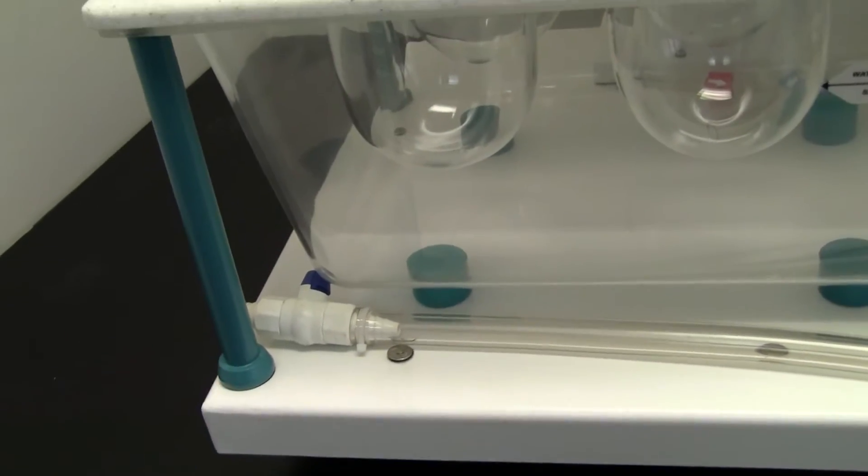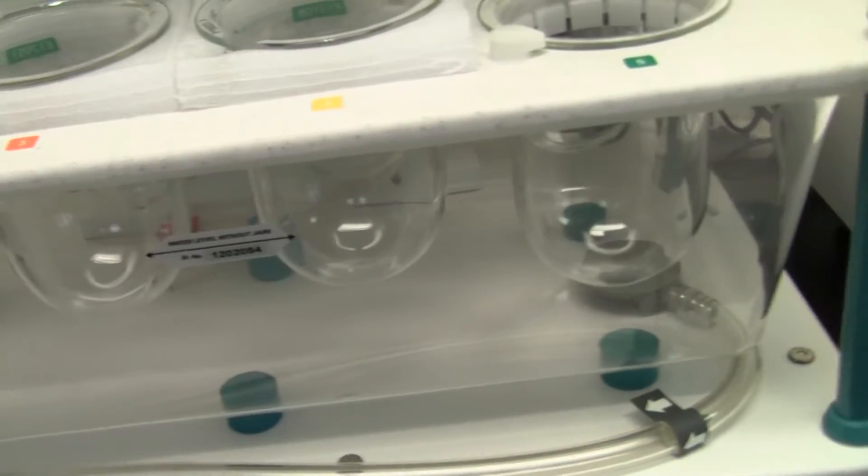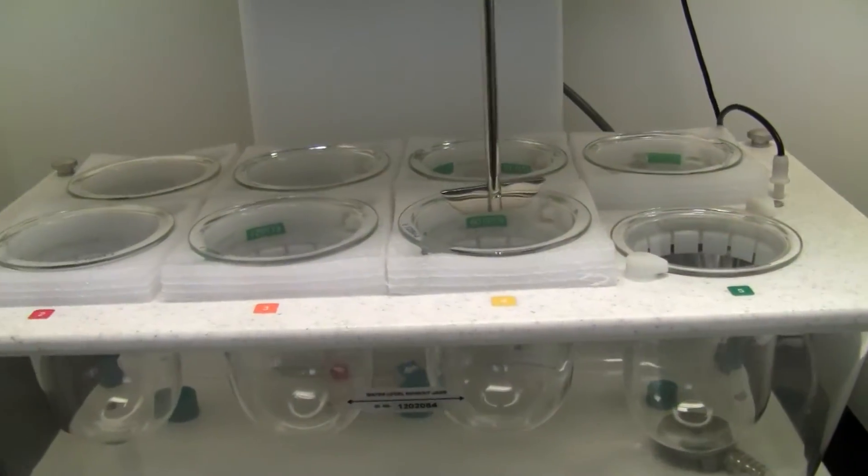Drain right on the bottom. Most everything on the back, the back connections have quick disconnects, which is really convenient.